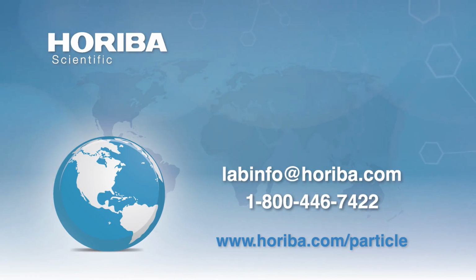So in the case of Surerelease, for an aqueous latex dispersion, things like your processing temperature, so your product temperature, spray rates, dispersion solids content, and those kinds of variables that go into your process and coating parameters would be determined by Colorcon, and we would make those recommendations to you when using those coatings. Okay, so I would always recommend a DOE-type process throughout the development to determine what your critical process variables are.